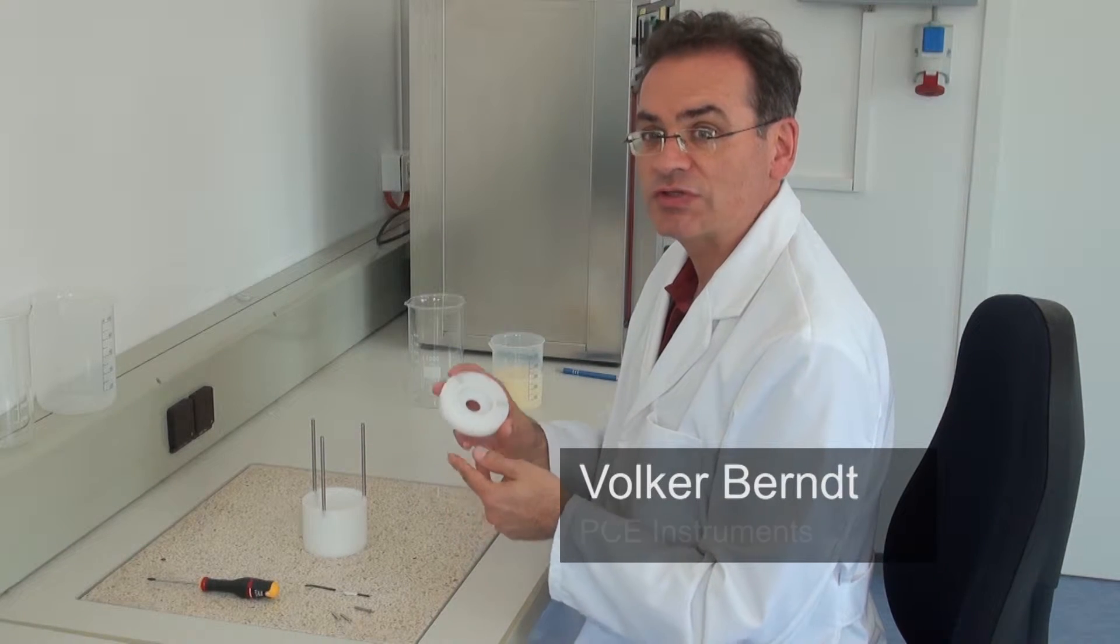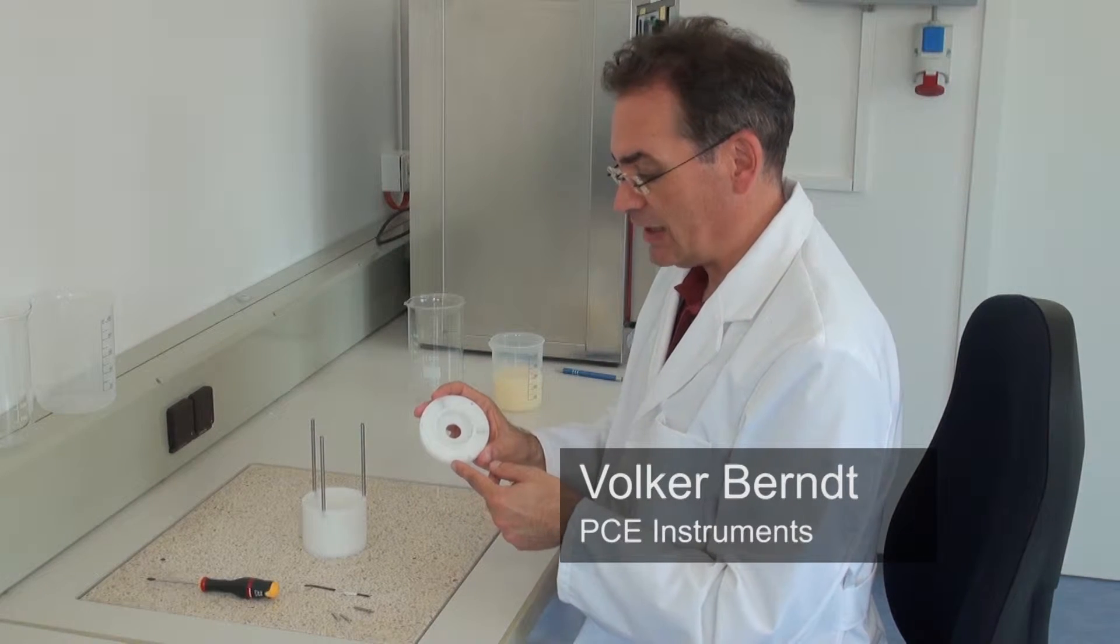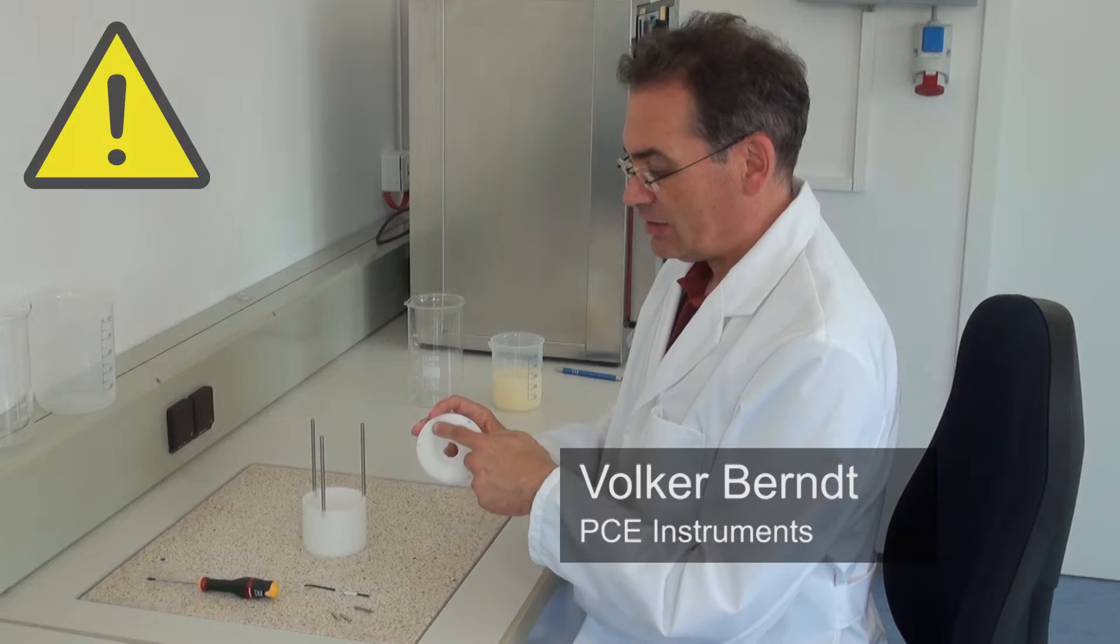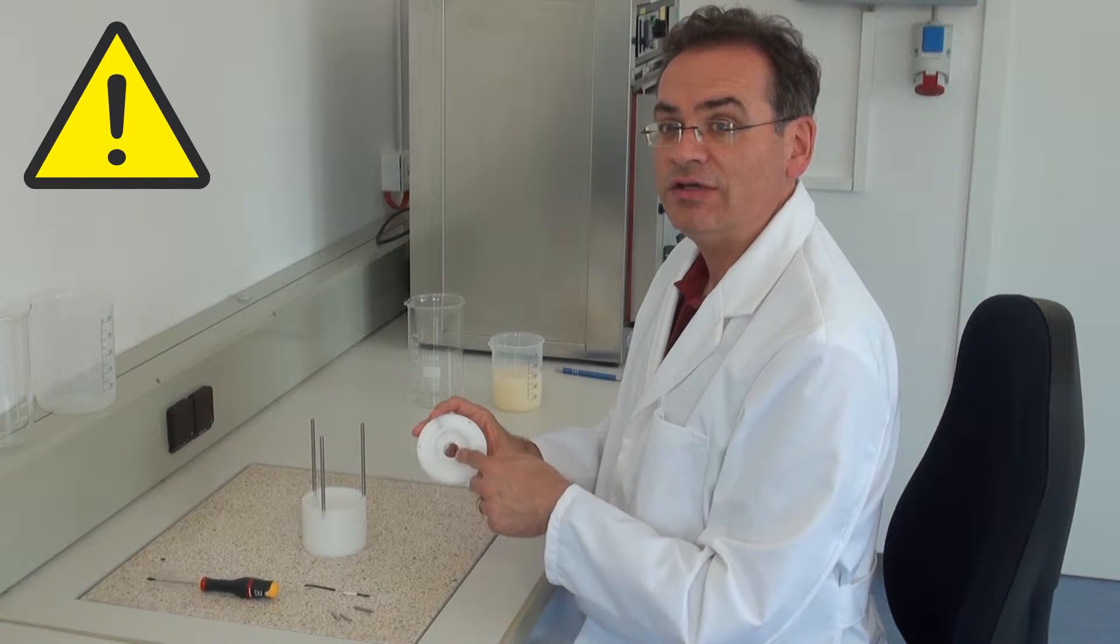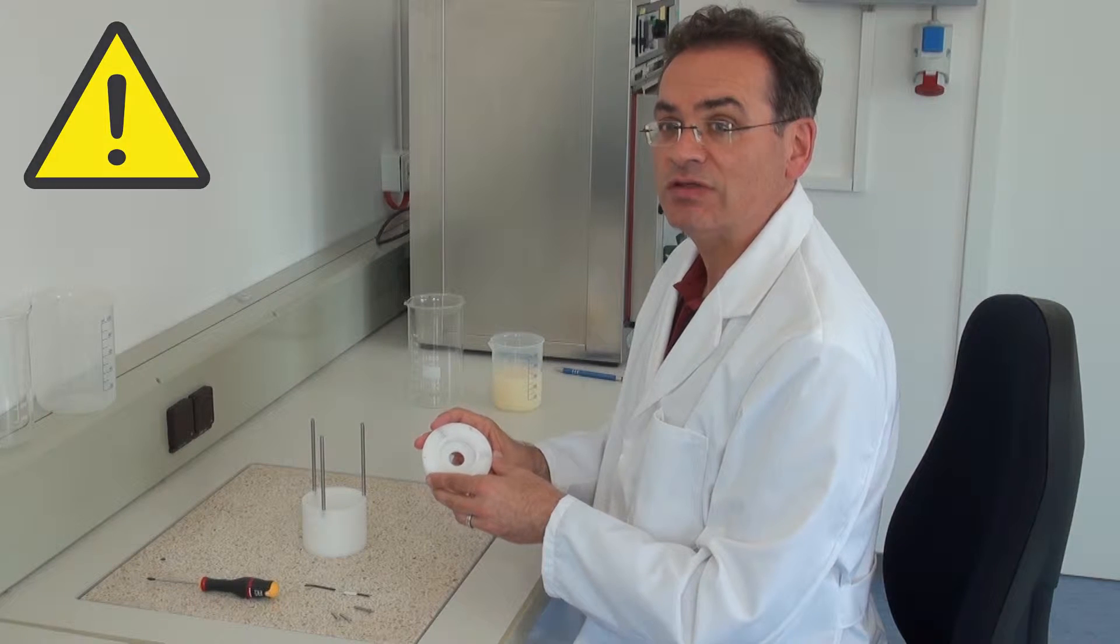Now the lid of the protection cage is screwed on. Here is to watch that the groove of the lid shows upwards, because later the viscometer is attached here.